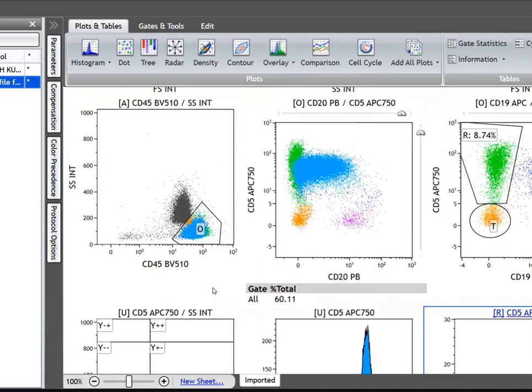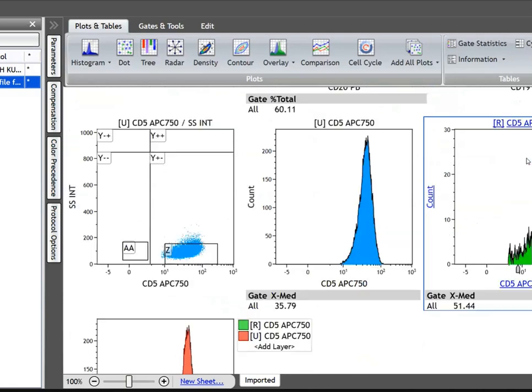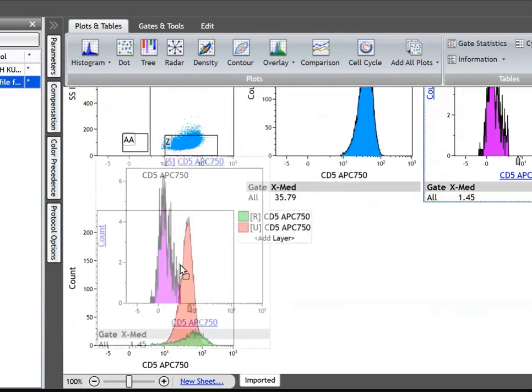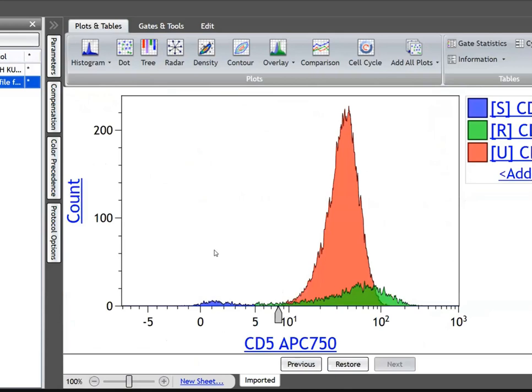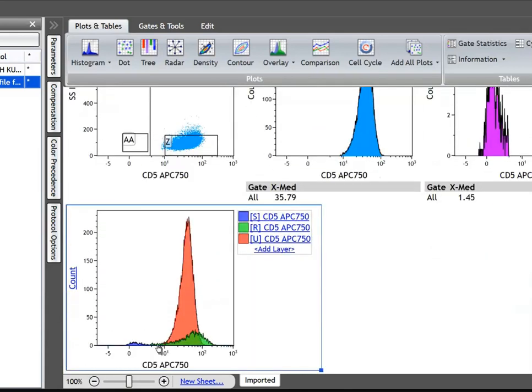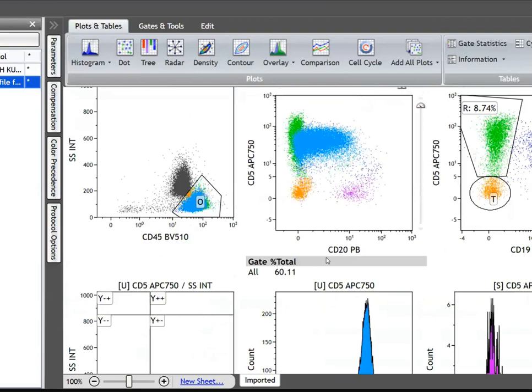If you want to bring in one more population, for example, let's bring in a negative control S. I'll drop S here, and I'll also pull that here in the overlay, which acts as a negative control. It's falling here because it is smaller in size, since the size of the population is so small. Okay, so that is about statistics and overlays.